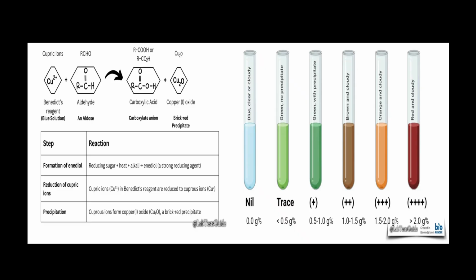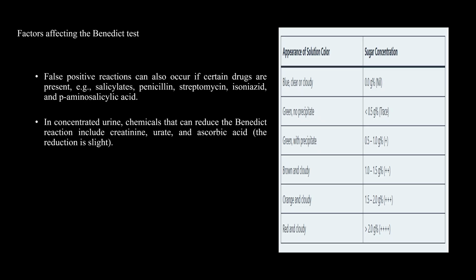Greater than 2 percent. Benedict's test is used to detect reducing sugar in a solution.